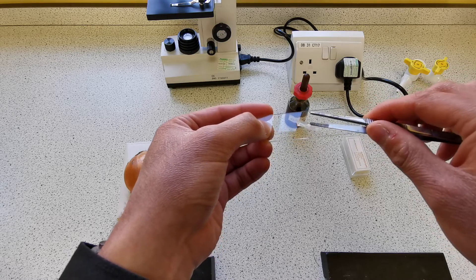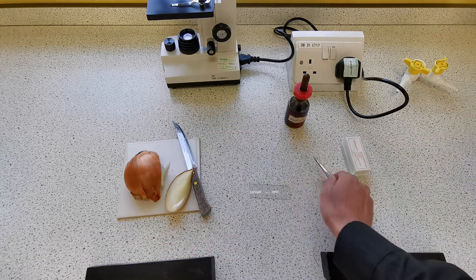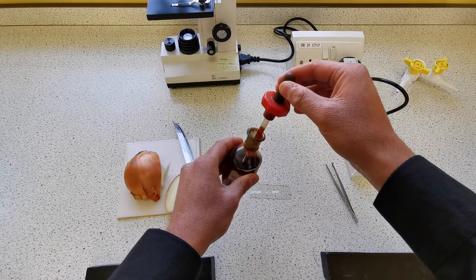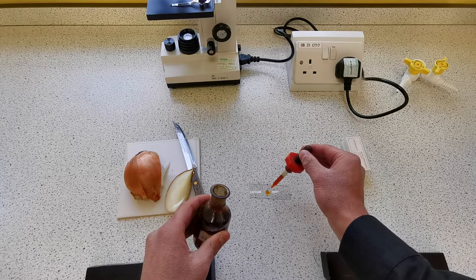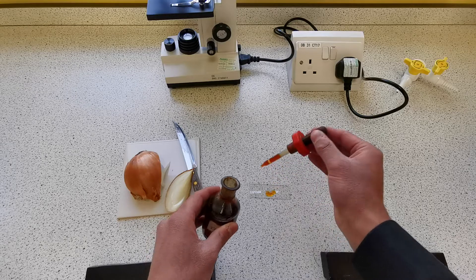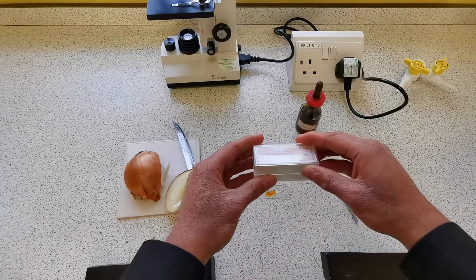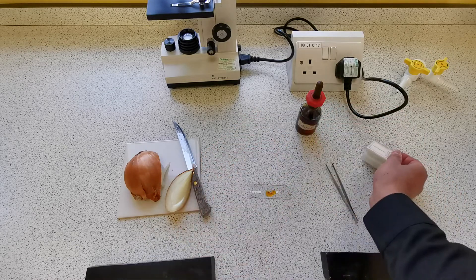On top of this we want to add about two to three drops of iodine. Now iodine can stain your skin, so it's very important you don't get it on your skin. Just two to three drops — one, two, three. Then we want to get our cover slip and put it on top of the sample.